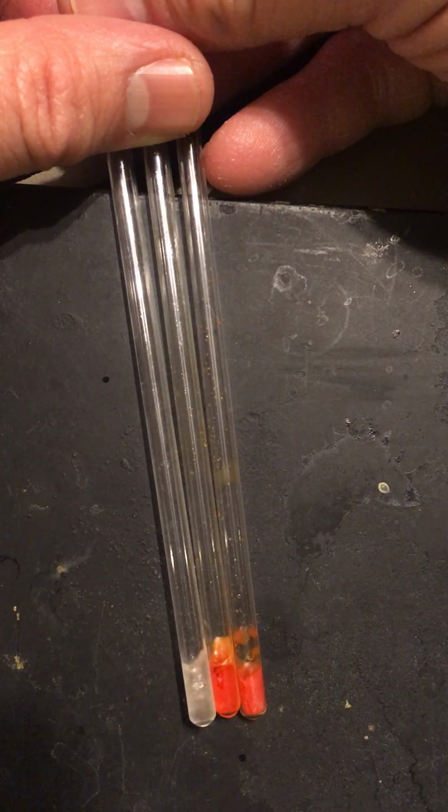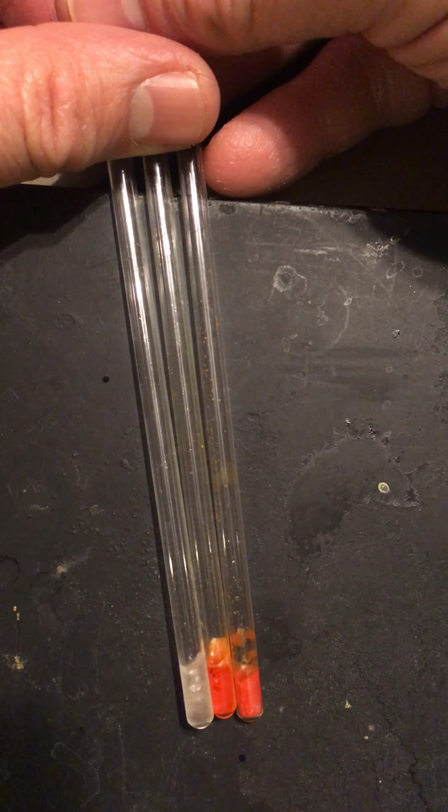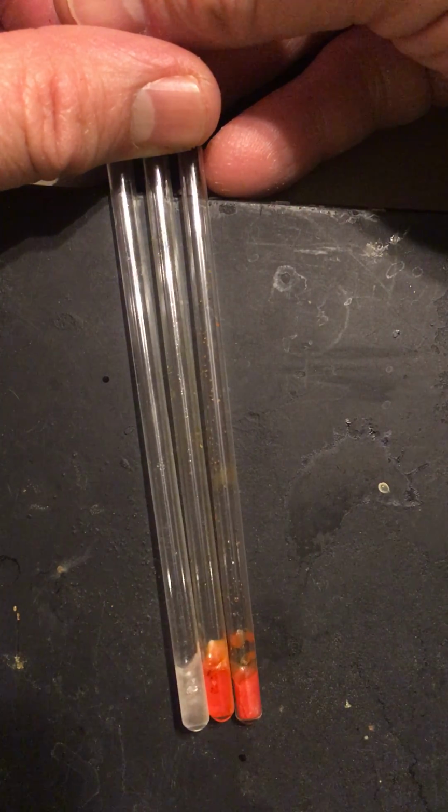And you can see that by now all of these samples that I have on this metal plate have turned to a solid.